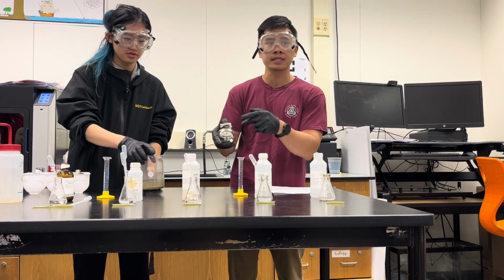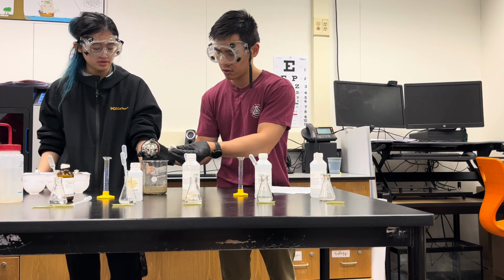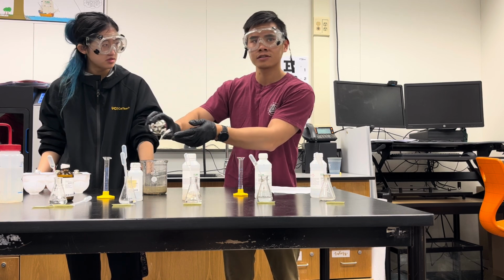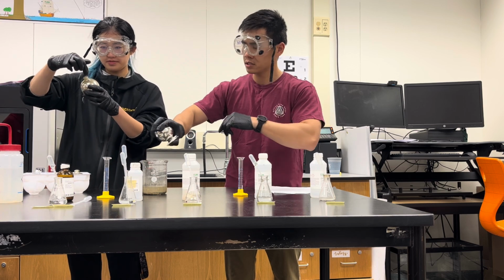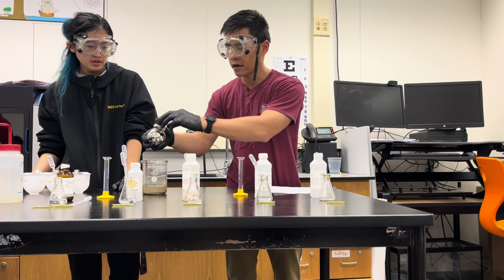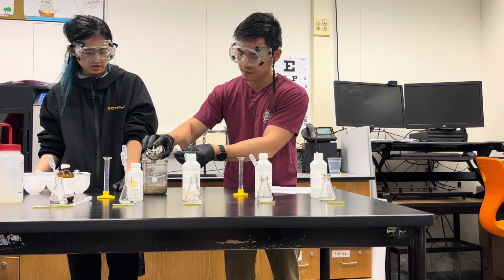One is I'm gonna dump this out into the waste beaker. Actually, you know what? The top of it isn't silver yet, like where the actual tip of the ornament is. So I'm gonna try to get that silver. All right. Now I'm gonna dump it out. Didn't work too well. Ew.